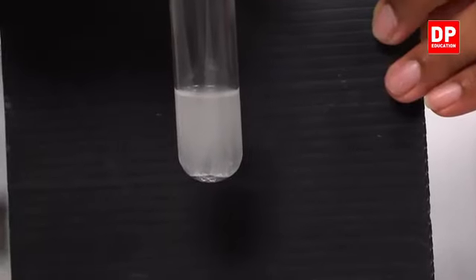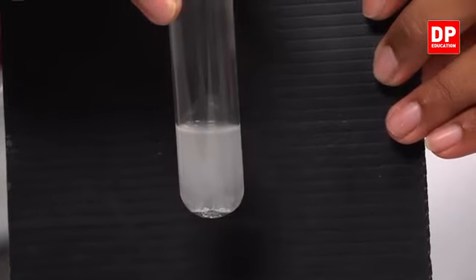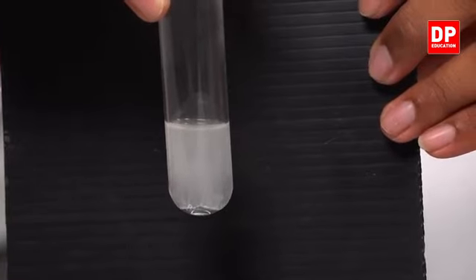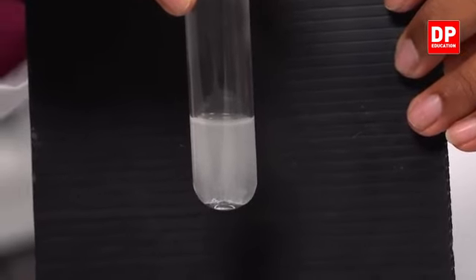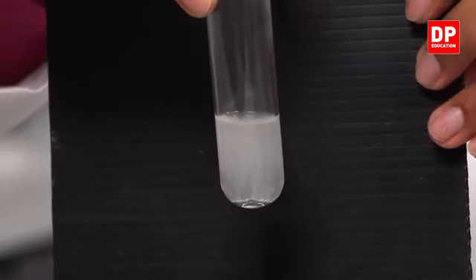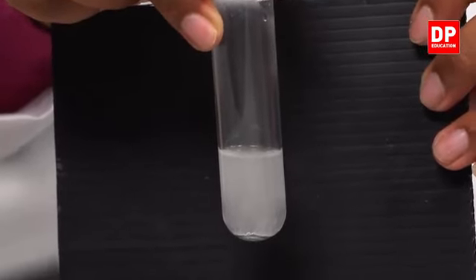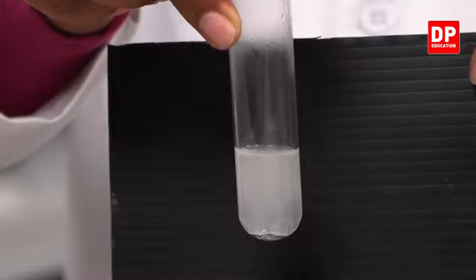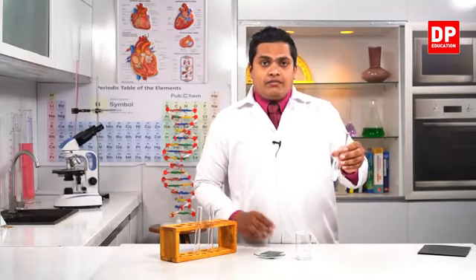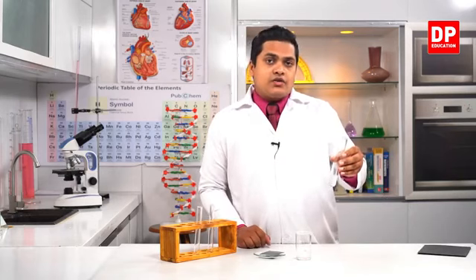Here we can say that a new substance has been created, and that new substance is hydrogen gas. So in the next grades we'll observe how to identify this hydrogen gas. But you could clearly observe that some amount of gas bubbles are emitted in this system. So we can conclude that new substances have been created.